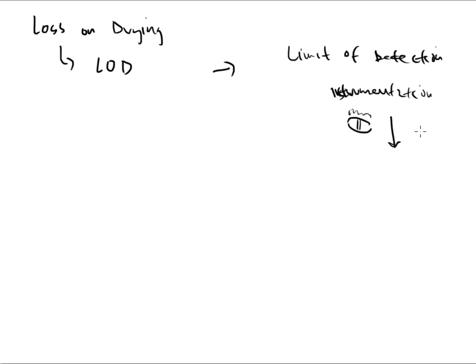All right, so the concept here, folks, is very simple. This video doesn't need to be very long. It's just to give you a little bit of background into this whole world of this fancy term that's called LOD. So what will happen is that I will take a substance, and that substance can be anything, folks, that has moisture. Things are very moist. You know, I hate that term. You probably hate that term. Who likes the word moist? All right, well, we have moist things in the lab, and those moist things have to be tested for the moisture that they carry with them.